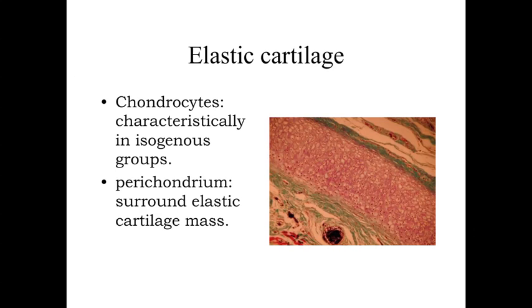So if you'd like to take a look at this, especially with a stain, which is going to allow you to see the elastic fibers, you can see instead of the nice smooth appearance that we had with hyaline cartilage, we can see the more fiber staining because we can see the elastic fibers in elastic cartilage. Again, chondrocytes, the round cells, oval nuclei, eccentric nuclei, often, especially within elastic cartilage, lots more of those isogenous groups that we talked about. So multiple chondrocytes within a single lacuna.